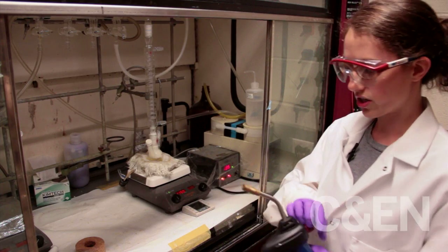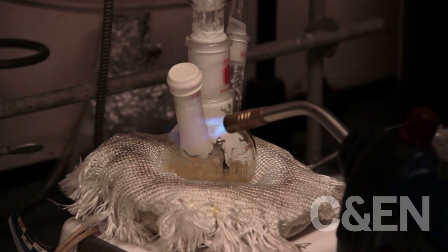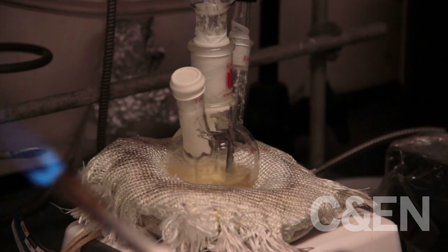I'm just going to use a handy blowtorch. You can see as I'm heating this up, it's falling back in. I don't want to heat it up too much, so I try to go slowly.